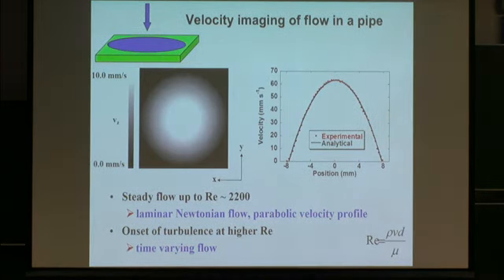So another thing that's been mentioned already today is that one of the reasons that MRI is such a powerful tool is because there are lots of different contrast parameters. You can get information about where molecules are and how much is there, but also about their local molecular environment and so on. One contrast parameter that I'm going to focus on today is the ability to measure the speed of the molecules. And so we can actually do velocity imaging with MRI.